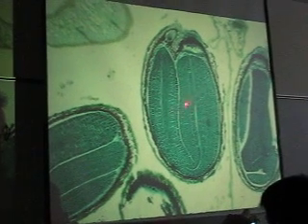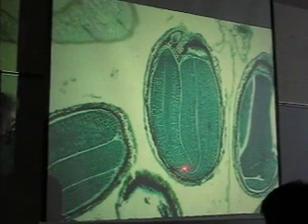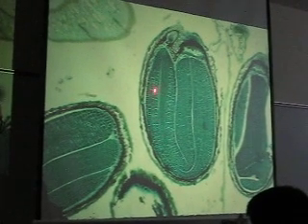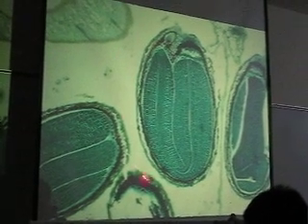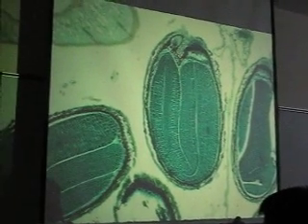Oh, these are the two cotyledons. 1, 2. How do I know? Because they're both attached right here. And that's the hypocotyl and radicle. The whole thing is a seed. That's one seed. Not a lot of room for that embryo, is it?